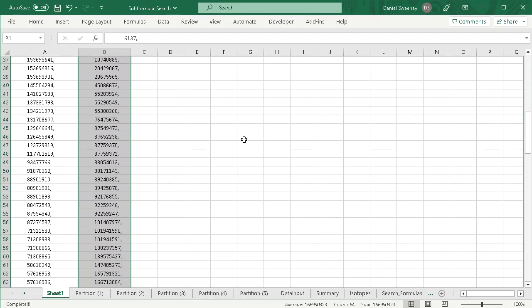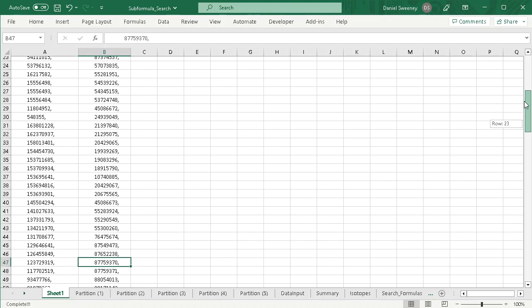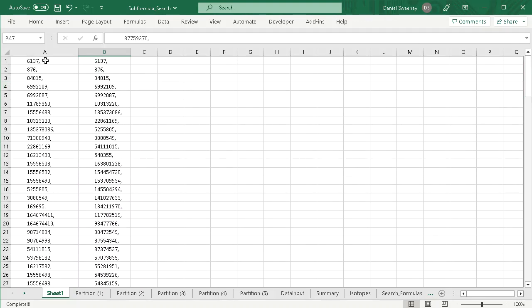Now you'd usually expect more hits, more possibilities if you do a mass search rather than a formula search. But in this case, a very large percentage of the molecules that have the same formula as methionine are labeled with, for example, C13 or deuterium.